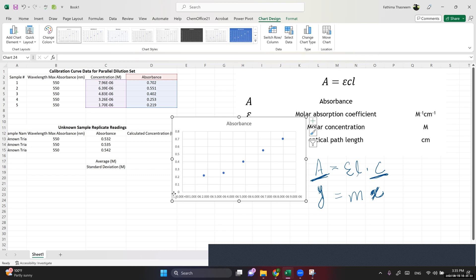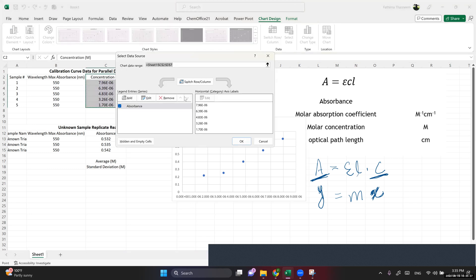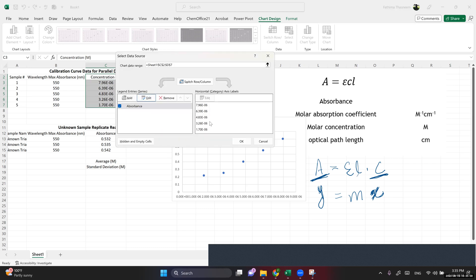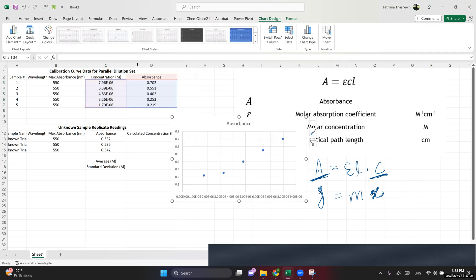For some people the axes get switched, so you can go to Select Data and Edit, and make sure the x-values are correct. Here it says C3 to C7, so that column is the x-values — that's correct. If it's incorrect, you would simply delete it and reselect. Then check the y-values — the absorbance values have also been taken correctly.